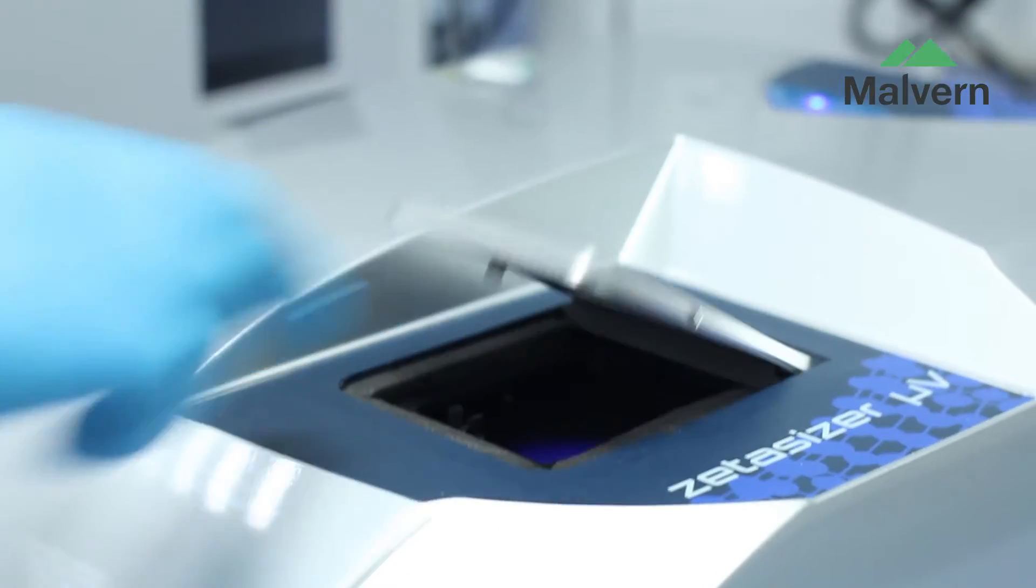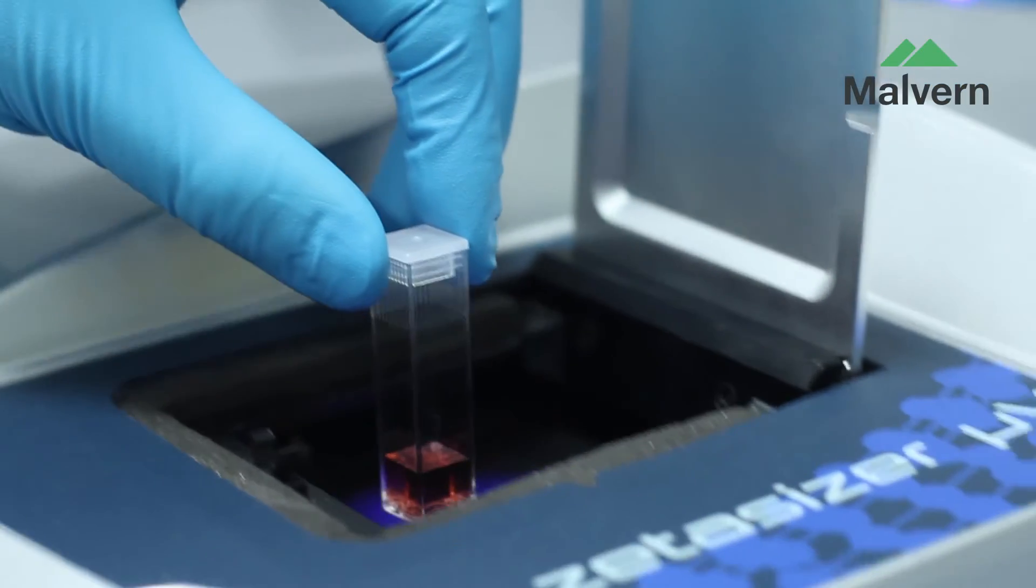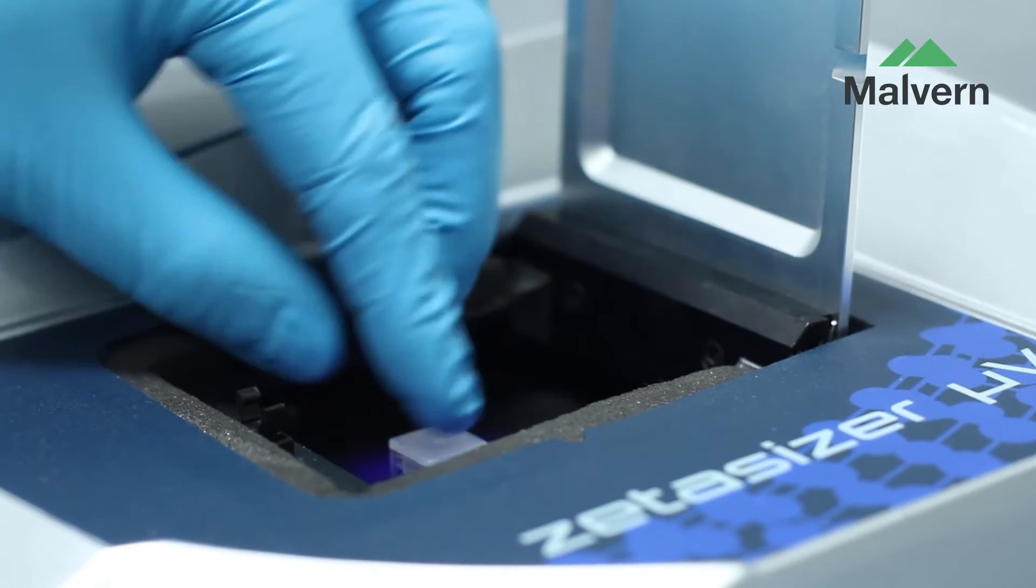With just a small amount of sample required, your protein solution can be measured by batch DLS to determine molecular size and the presence of aggregates.